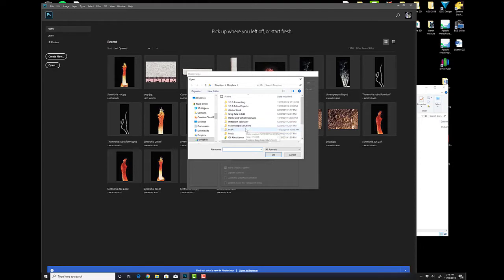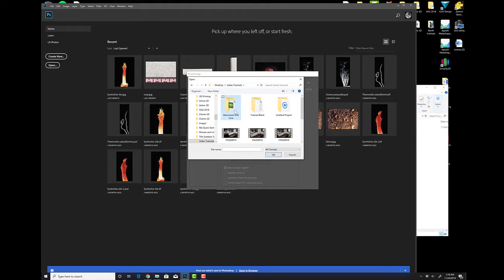you need to perform. So let's go back to our desktop. Let's navigate to that folder. So it's going to be Video Tutorials. We're going to do the Macropod MacroCore scanning, and here's our folder, and here are our images, and exactly there are 9 of them. So we're going to hit OK.